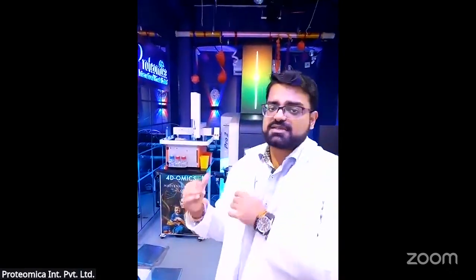Now, this is the first technology which works on TIMS technology. You just have to understand how this works. You can consider 2 ships moving out. One has a bigger curtain; the ship which has a bigger curtain can gather more air, and it will move faster. Similarly, in TIMS, we work with cross-sectional areas. The ions which have larger cross-sectional areas move out first, and the ions which have smaller cross-sectional areas leave later.